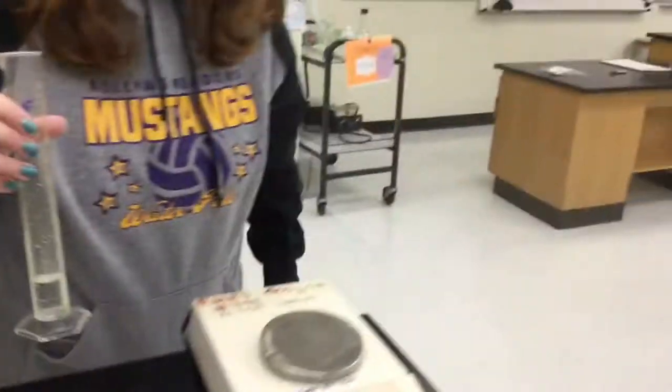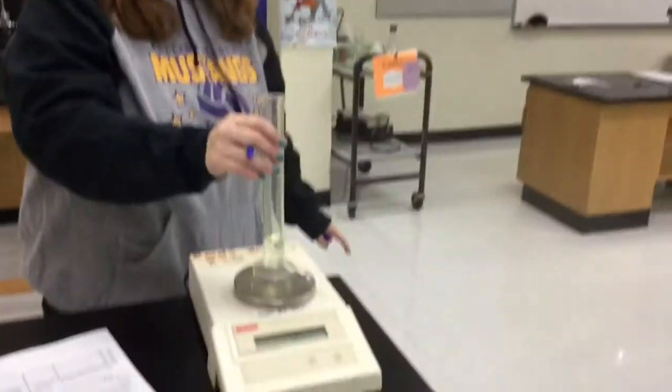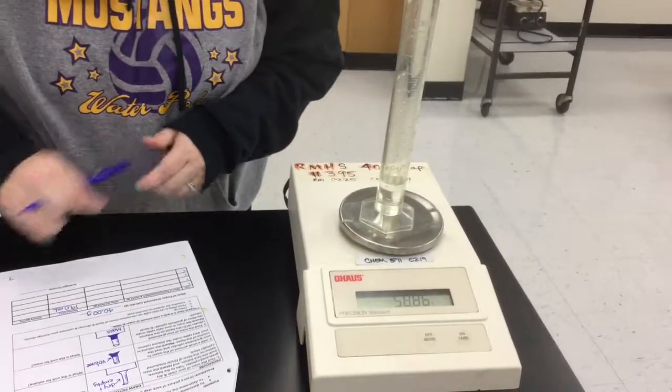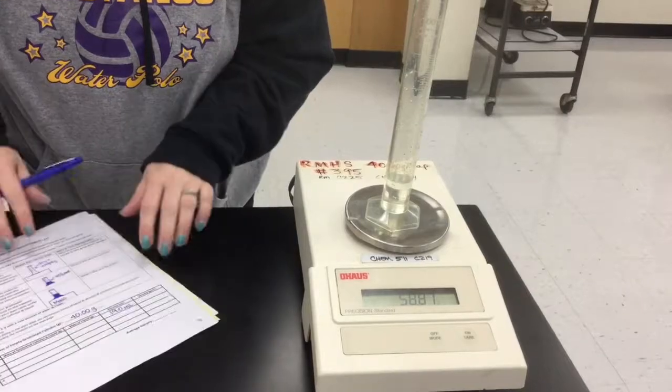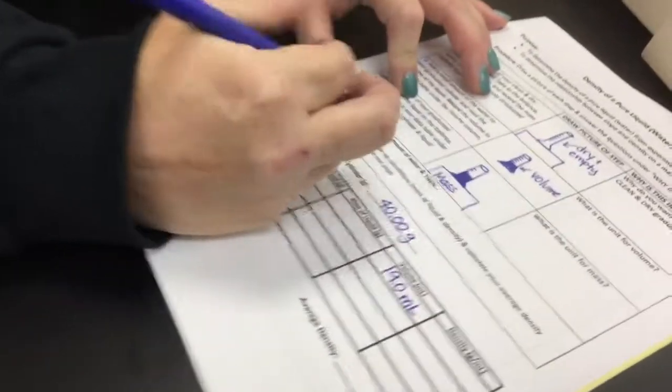Cool. Okay, so then my balance is on 0, it's tared. Okay, I'm going to put the graduated cylinder plus the liquid on there. Okay. And I got 58.87. Yes. Okay, so that goes right here, 58.87 grams, mass of graduated cylinder and liquid.